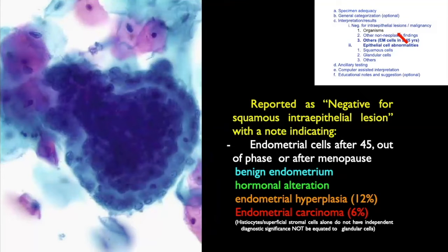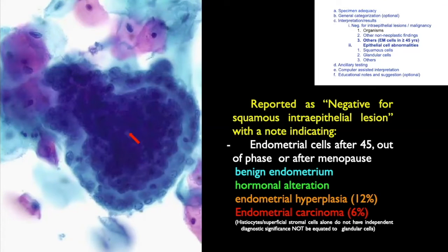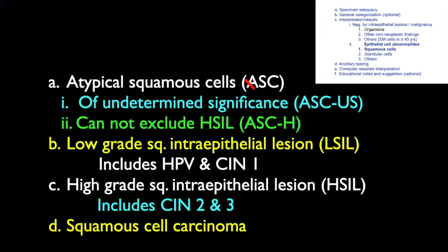Now we are talking about endometrial cells in the third compartment — negative for intraepithelial lesions. The peripheral cells are epithelial cells and the central ball contains stromal cells — this is known as 'exodus,' predominantly seen in menstrual endometrium. You can occasionally see them in non-menstrual periods in women under 45 years of age. But when you see endometrial cells in women over 45 years of age, you must think of hyperplasia or carcinoma and investigate.